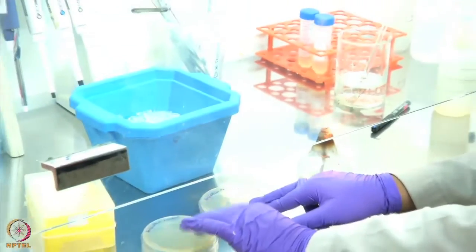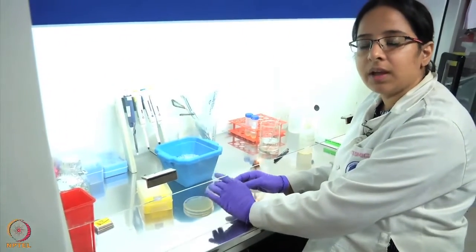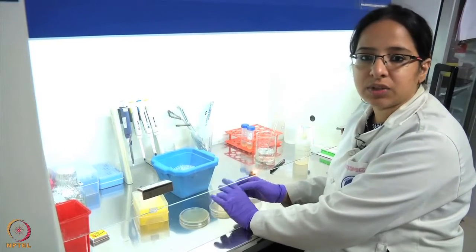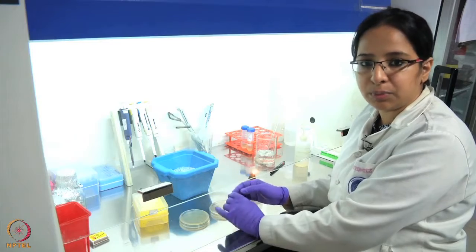For one plate, I will be using the ligated sample which has been transformed into the DH5 alpha host cell. For the other plate, I will use the negative control, which has been given the same treatment as our ligated product.